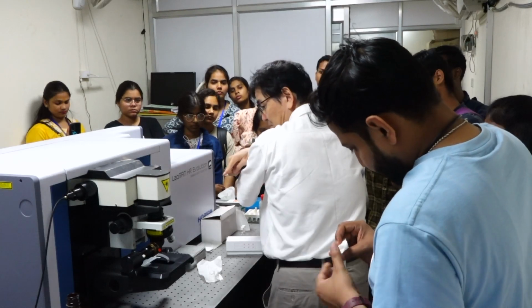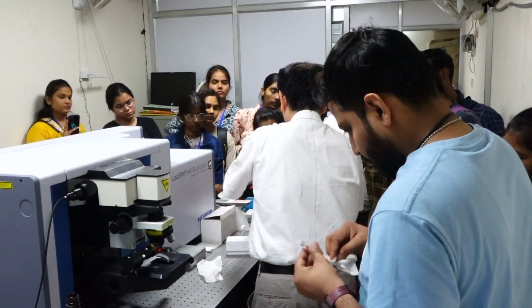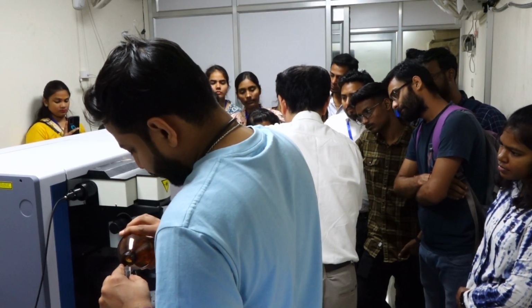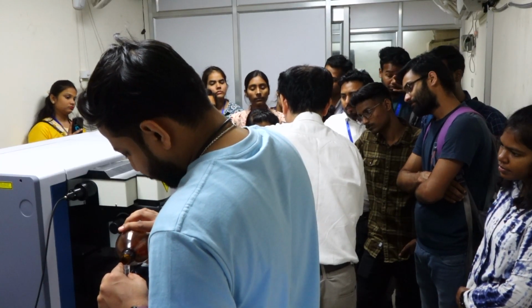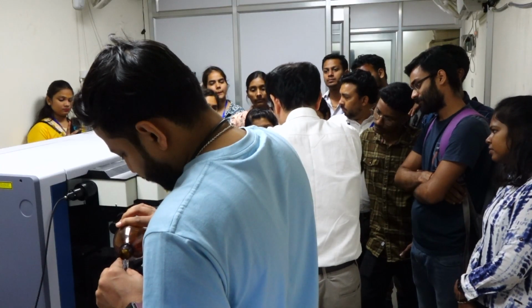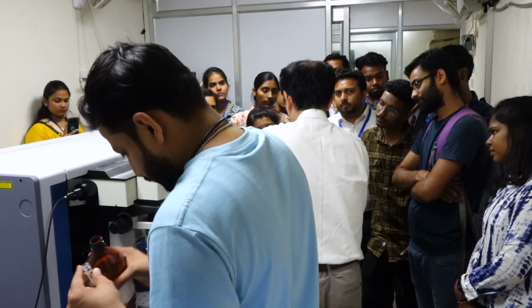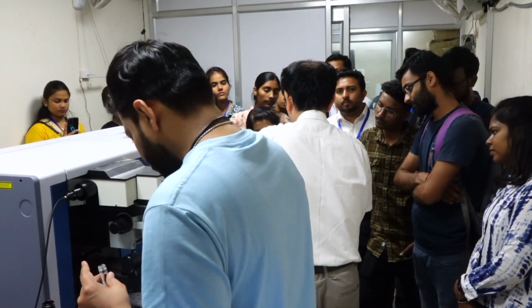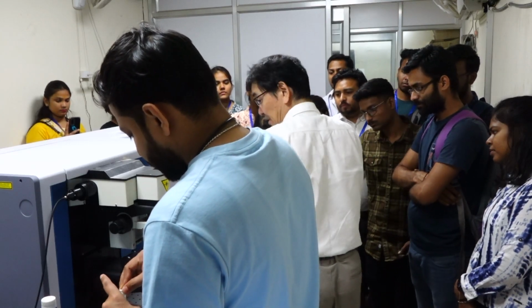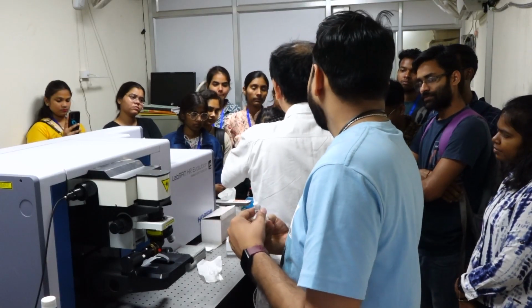In this microscope case, this objective lens serves as a focus lens as well as signal collection lens. So the scattered light is collected by this lens and delivered upward. So the laser beam comes from the top and the signal returns the same route. In this sense, this is a backscattering configuration. Okay? But anyway, this is very convenient too because the laser focus can be very small.